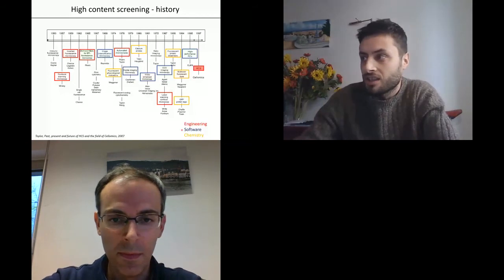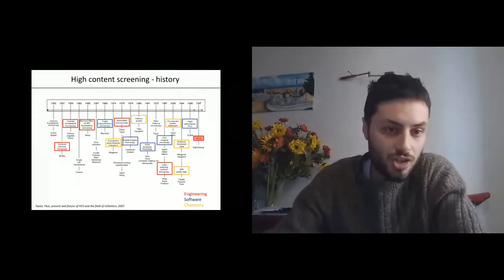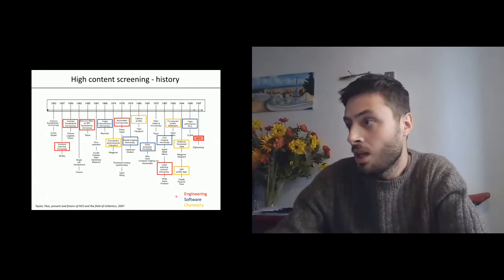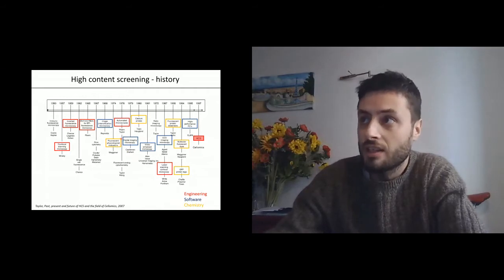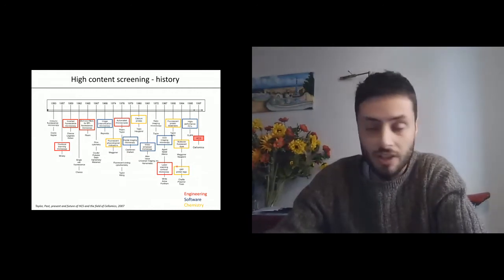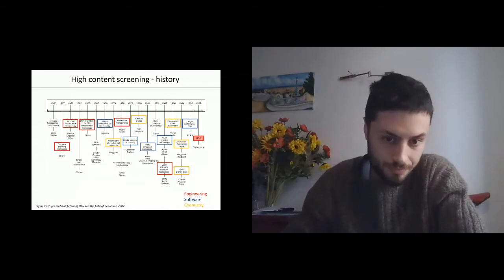On the other hand, there were advancements on the software side. In particular, I would like to highlight the ability to perform digital imaging microscopy and the advancement in high performance computers. And finally, because we are mostly interested in fluorescence microscopy, there were several advancements in the chemistry part: the design of fluorescent physiological indicators, all the way, more recently, up to the discovery of fluorescent proteins that allowed us to probe and visualize structures inside cells and inside biological objects.